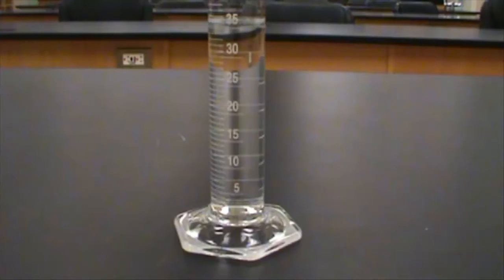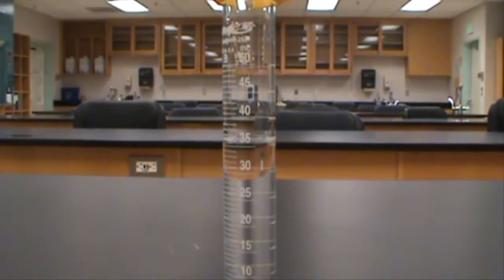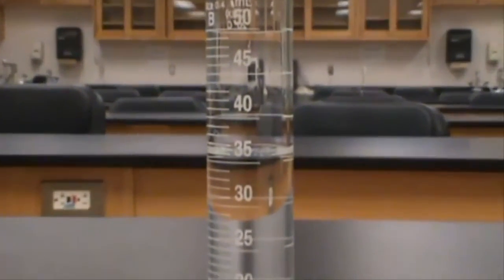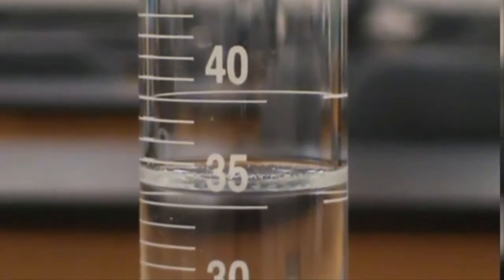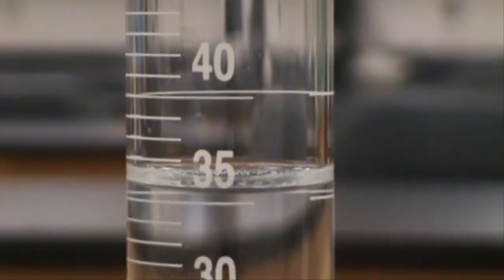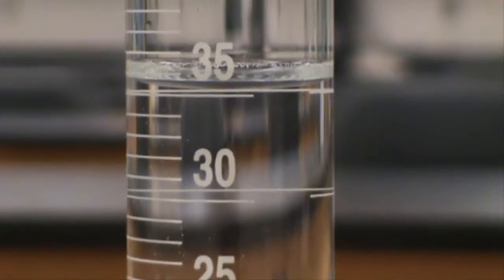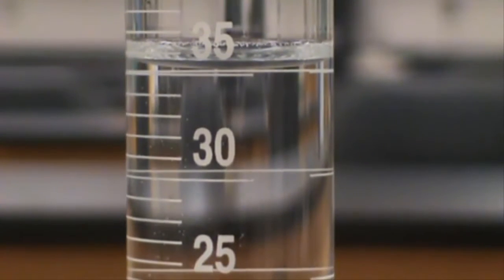what the measurement is. How you take a measurement is you look at the meniscus, which is the bottom of the curve of the liquid. You need to look straight on at the cylinder, so you may have to bend over. Do not pick it up to read it. After you decide what the measurement is, record it with the unit as the initial volume of water in cylinder.